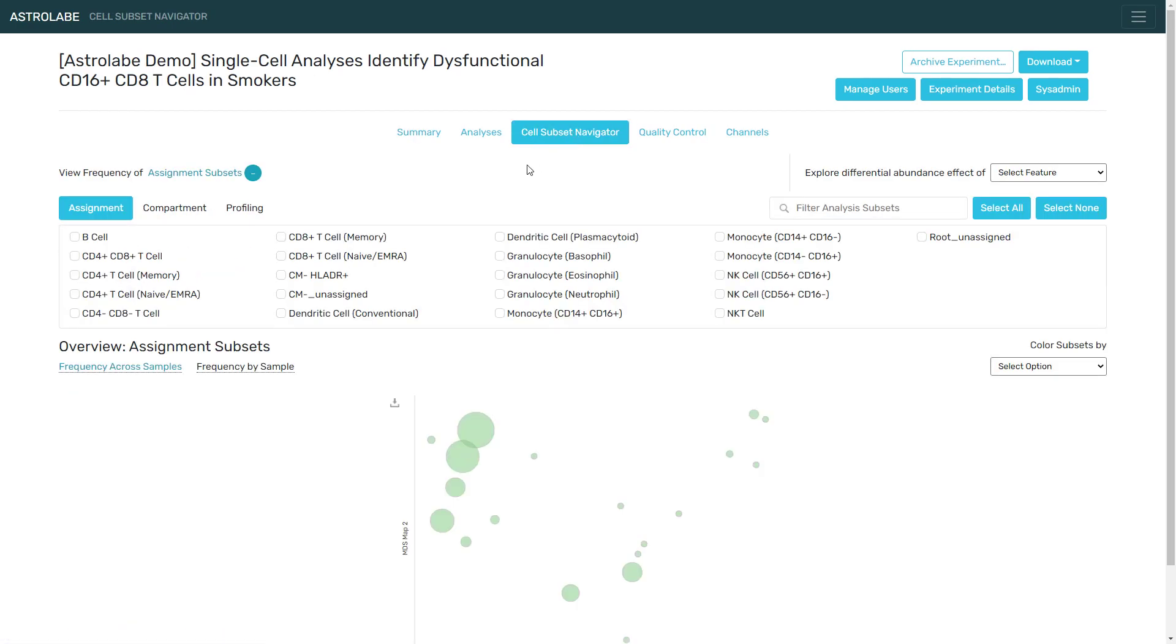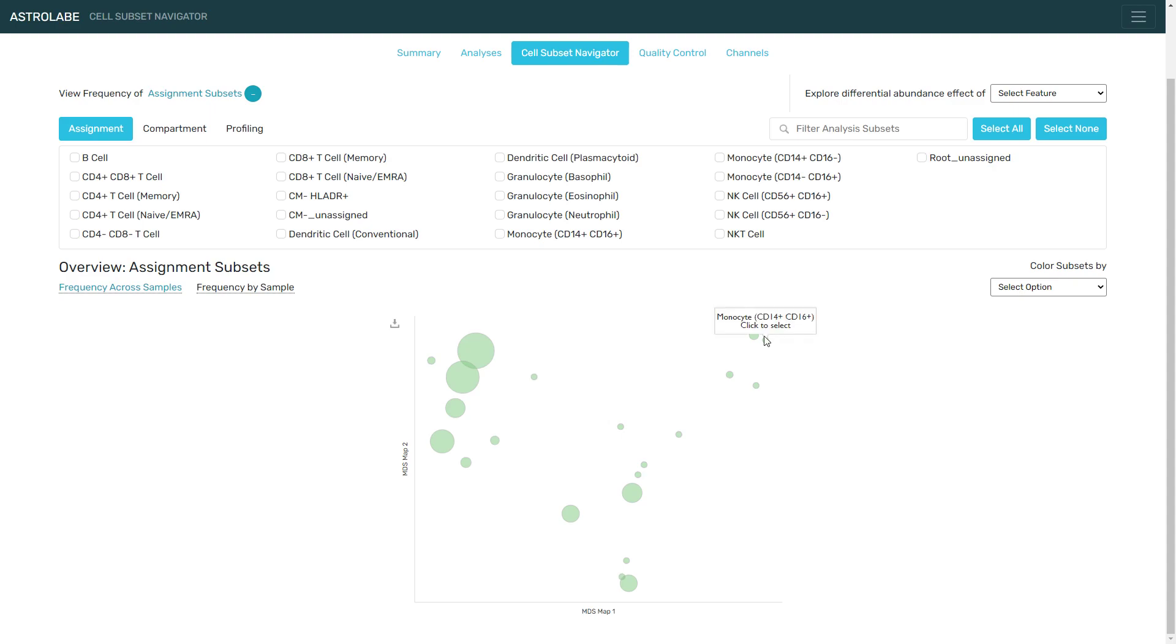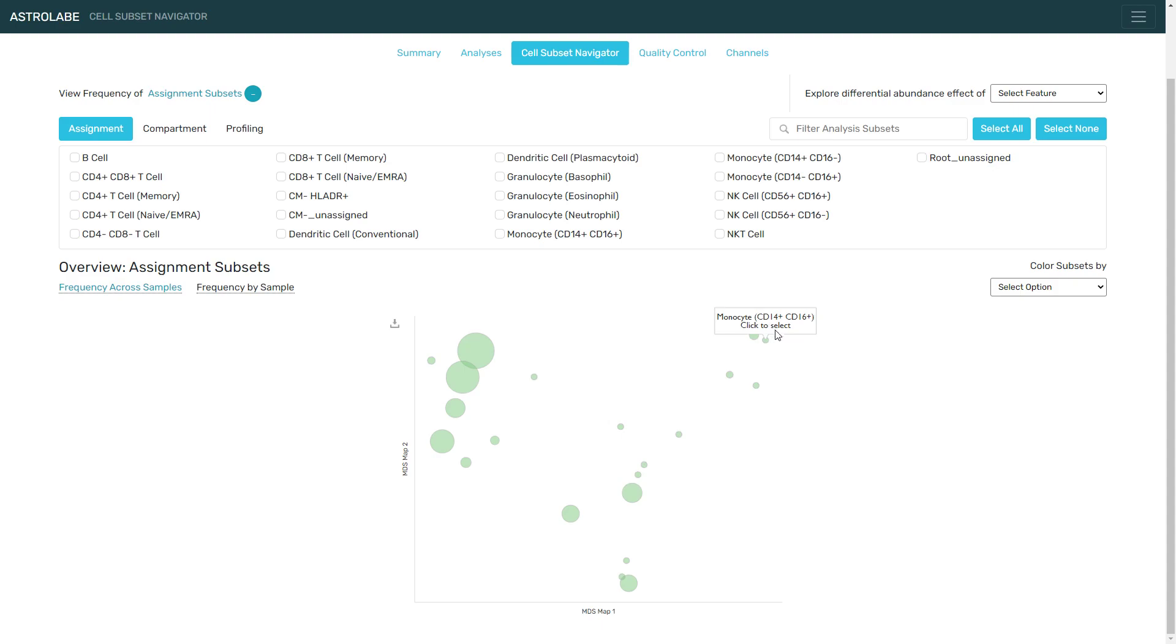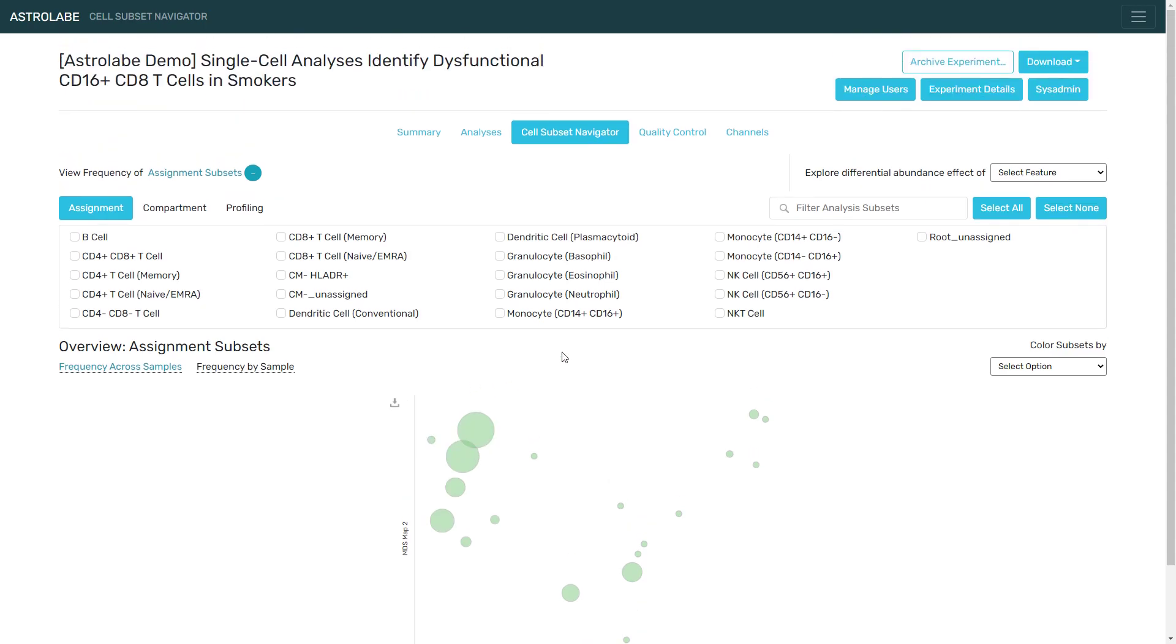This is a composite view of the entire experiment using data from all of the FCS files. You can see how Astrolabe identified the major cell populations up here and then organized them down here in a dimensionality reduction view. So here are the B cells, here are the myeloids, and finally the T cells are here to the left.